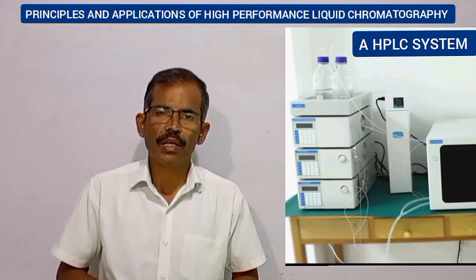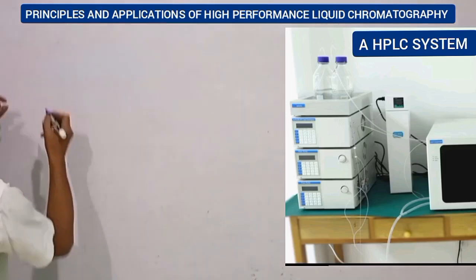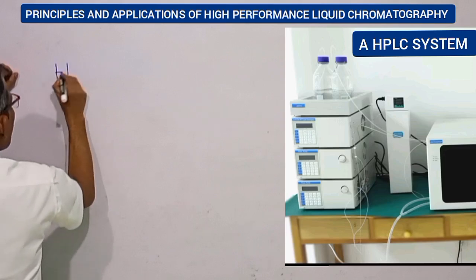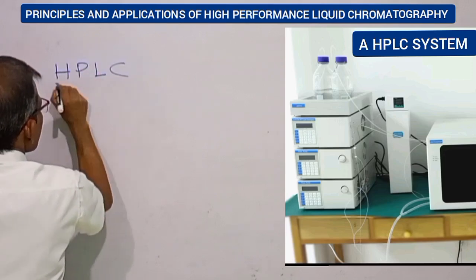Today we shall discuss the principles and applications of high performance liquid chromatography.